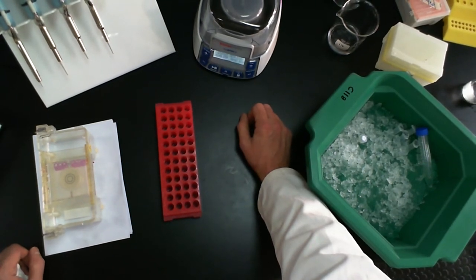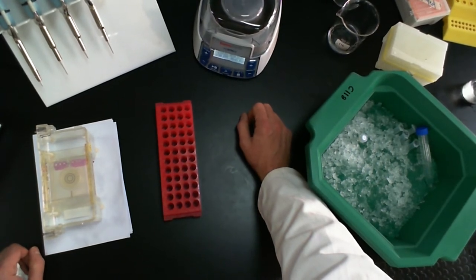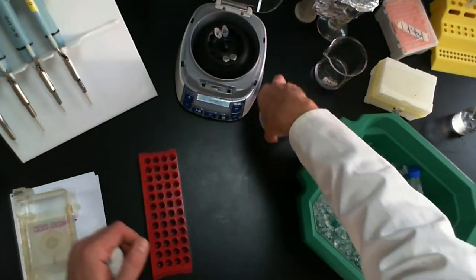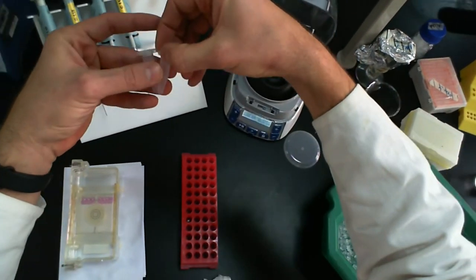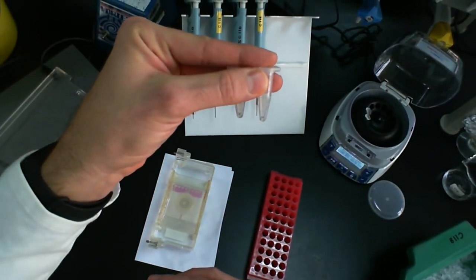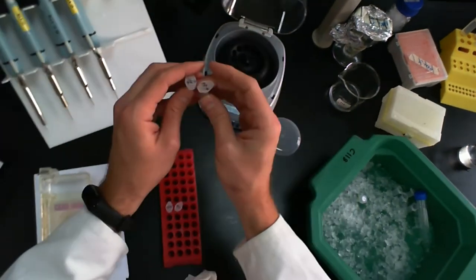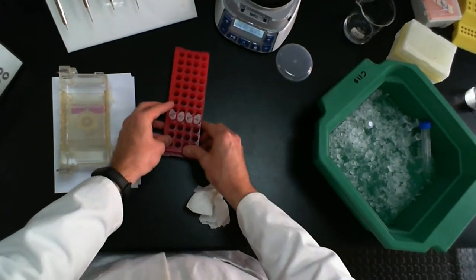Okay, so 30 seconds. Okay, so we're done. Take the cap off, and now all the condensation should be at the bottom of the tube. So again, we have 20 microliters exactly at the bottom of these tubes, if you can see that. No condensation on the sides, so I can set these down, and these guys out as well. So this is P1E, P2E, and N, so this is in the right order.